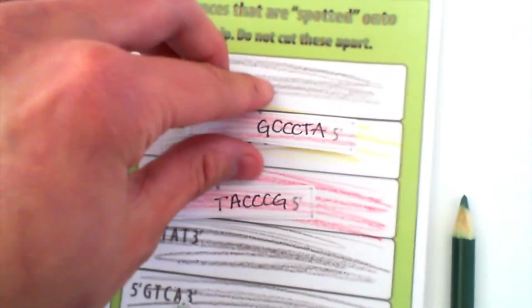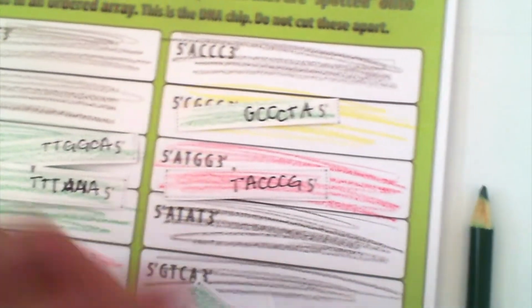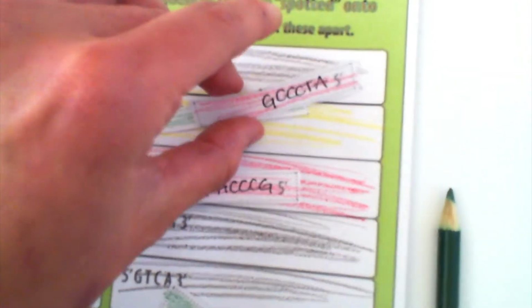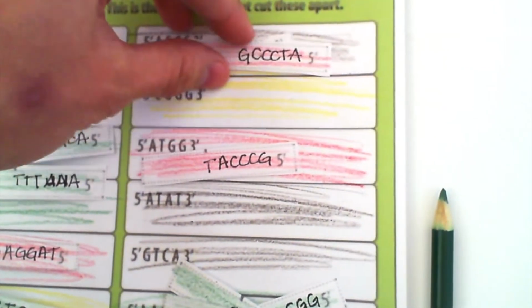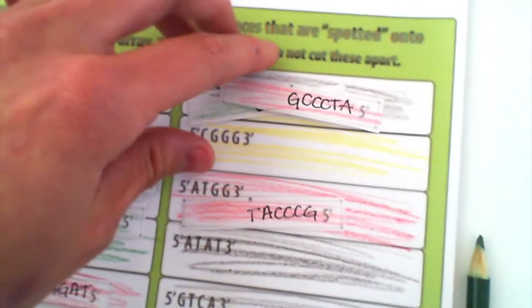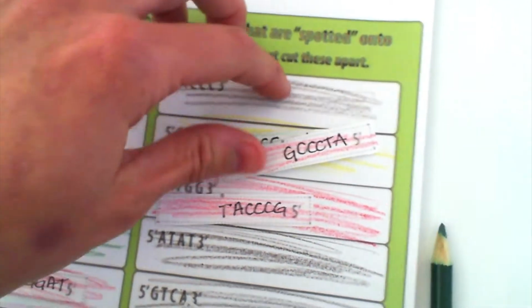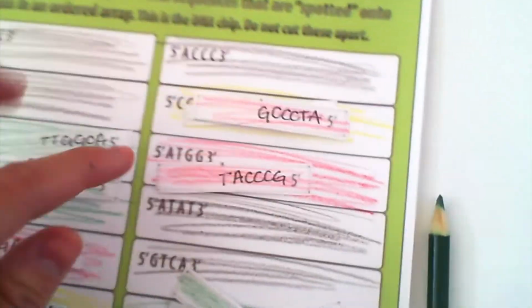In this one, we have one red cDNA and one green cDNA from the plant given light, which would make the cDNA for that gene pop up yellow, meaning that for the plant with light and the plant without light, they will equally express. So that gene is not of interest.